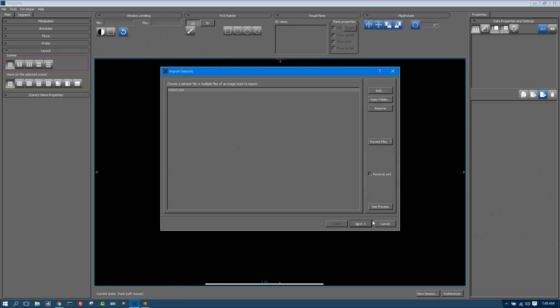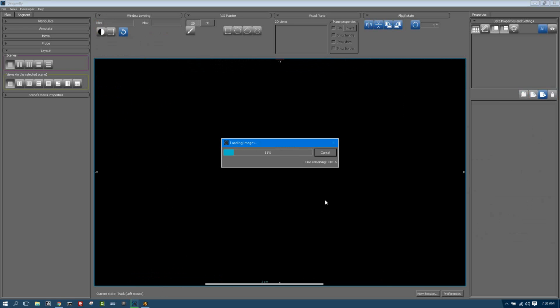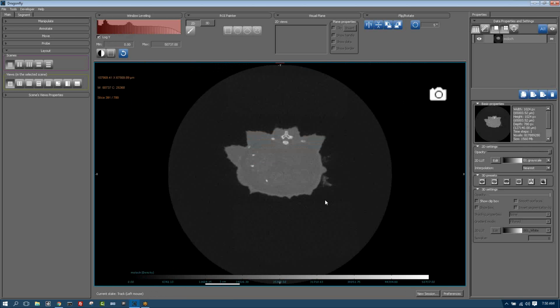The data set I'm loading now is a CT scan and reconstruction of a Moloch, the thorny devil. This data was collected and archived at the Digimorph online repository maintained at University of Texas by Tim Rowe and colleagues there. So now I've got a specimen. Now this has not only the bones but also the soft tissue intact.